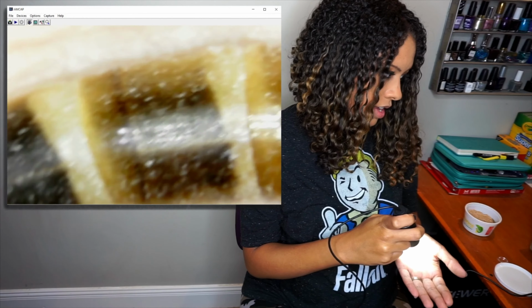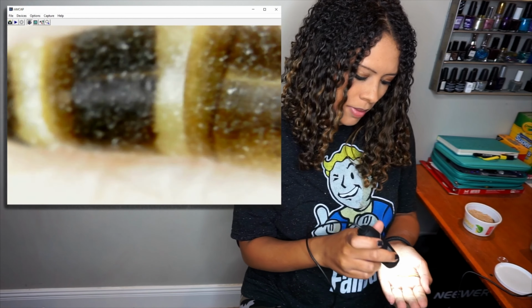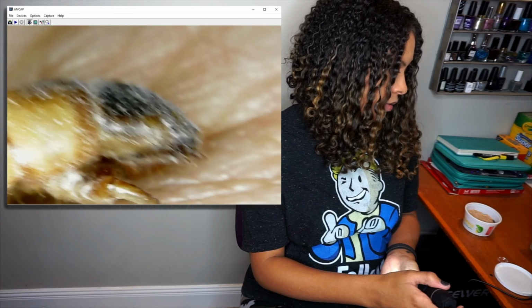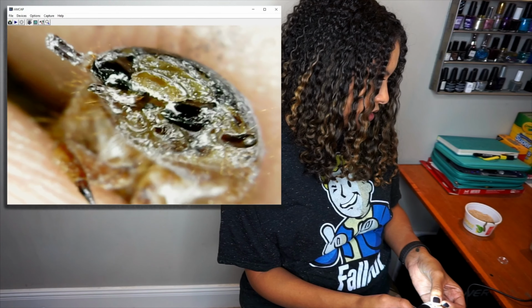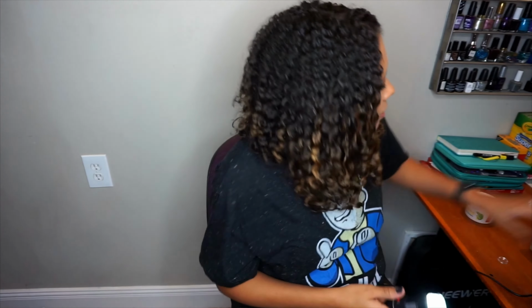That is what he looks like. That powder on him is the oat bran that comes with them in the little containers. That, if I can get it, there's his little legs. That is what his dusty face looks like. That is their little faces, and you can see he has his little pincers in his mouth because he's not pleased. Next we'll do the mealworms, which I imagine are going to look pretty similar, but we'll see.